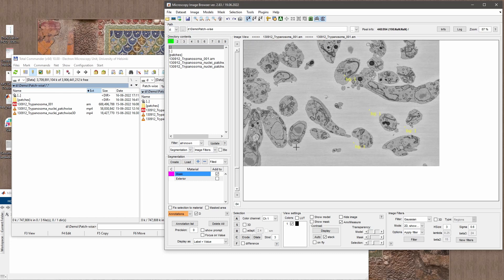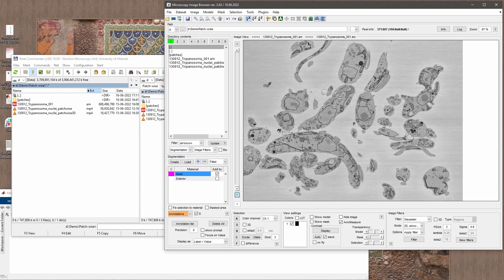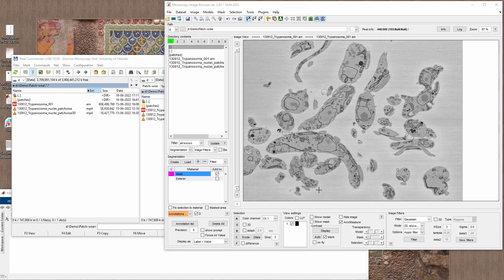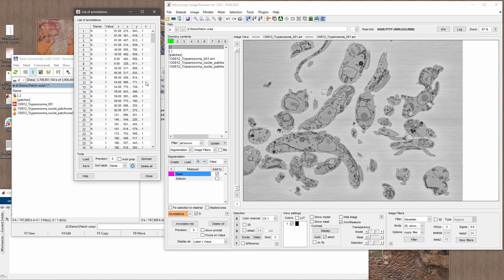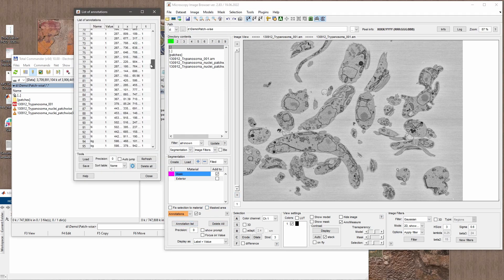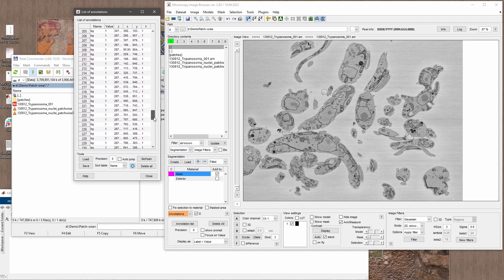Naturally, the more annotations you add the better results you can expect. The annotations are available in the annotation list — I've already clicked 295 times and have this sequence of background and nucleus labels.